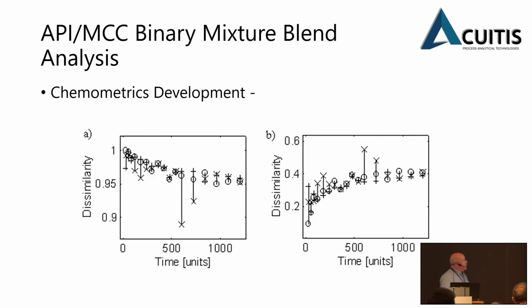As I mentioned, some model-free approaches were developed at the time using something called dissimilarity, which has gone out of fashion but was useful at the time. It gives an indication of not just the rate of mixing, but also, using a target of 2 of the raw materials in the blend, the API and the major excipient, the overall distribution and breaking up of aggregates and lumps to form a uniform blend at the end.